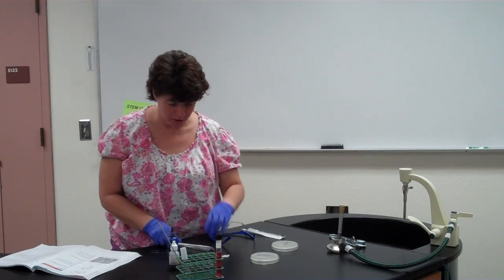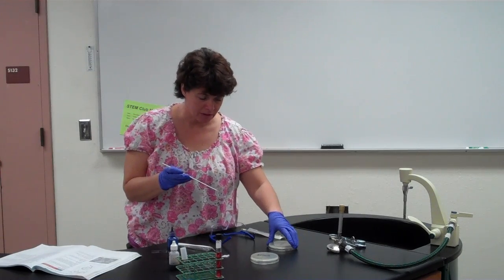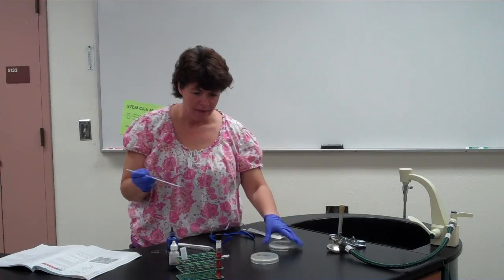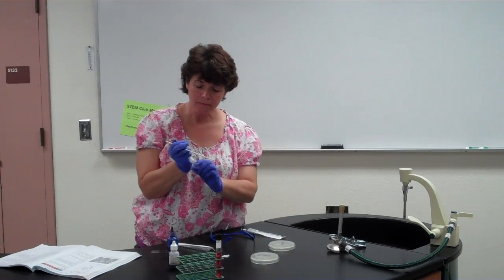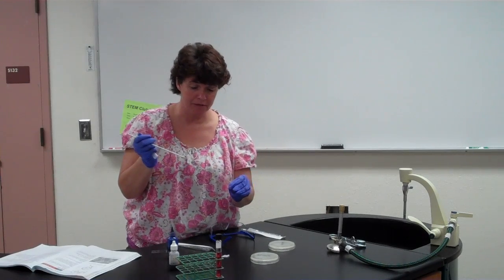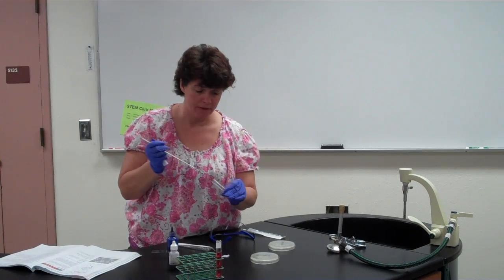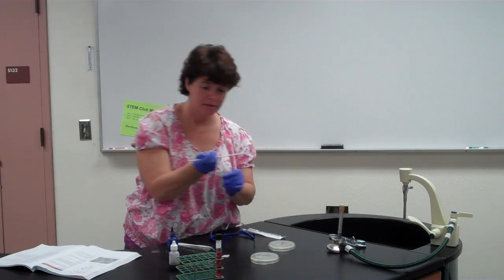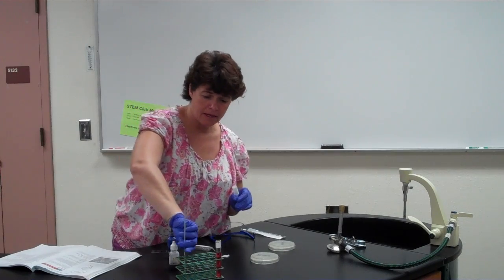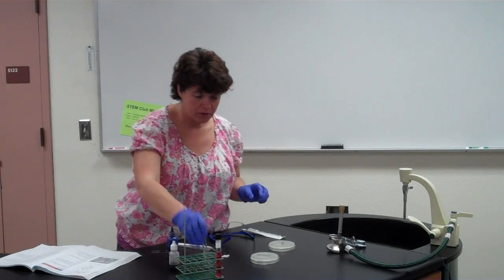In this particular one, what you're going to do, and I'm not going to show the whole procedure with the yeast, but you'll take your yeast and you'll put it into sterile saline, and so you'll use your aseptic technique just like you've done before. You put the yeast in here, and you're going to put quite a bit in there, using your sterile technique, okay? And then you're going to kind of just tap it like we've done in the past, and you want to have a good cloudy suspension of yeast. And then you're going to take a drop of that.